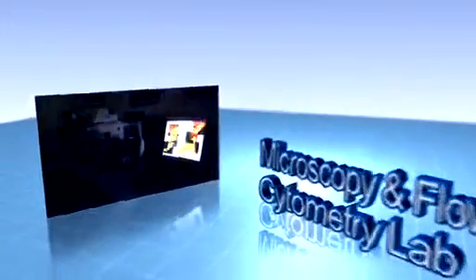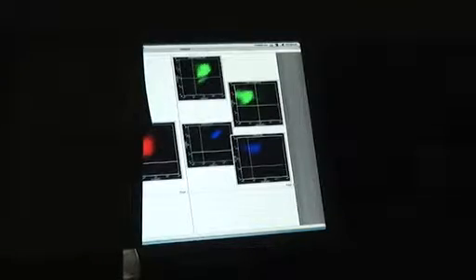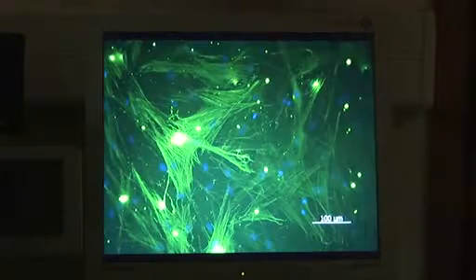The Microscopy and Flow Cytometry Laboratory allows the preliminary structural analysis of biomaterial specimens, such as 3D structures for tissue engineering applications, obtained from different processing methodologies, and the follow-up of its subsequent biological in vitro and in vivo characterization.